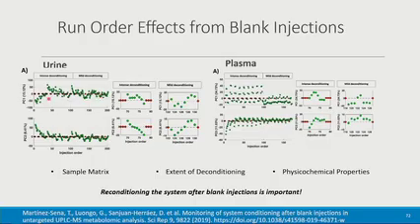At the beginning, where your column was deconditioned, we see everything is biased down. On this one here, looking at PC2, again, samples should project somewhere around here. This looks reasonable, but the ones at the beginning are projecting off in the wrong direction, again, because the chromatography wasn't stable when you did this, and or the mass spectrometry, I guess, as well.